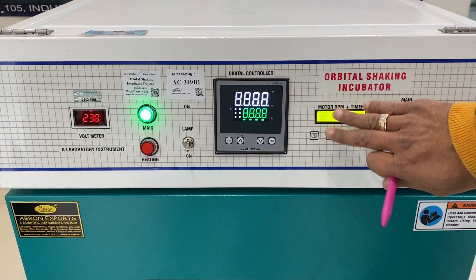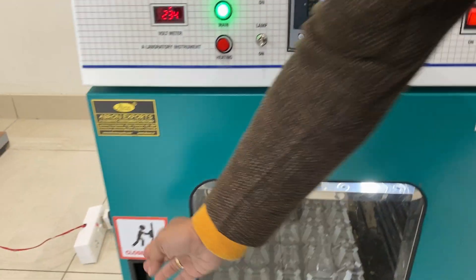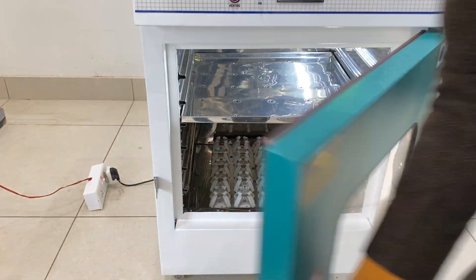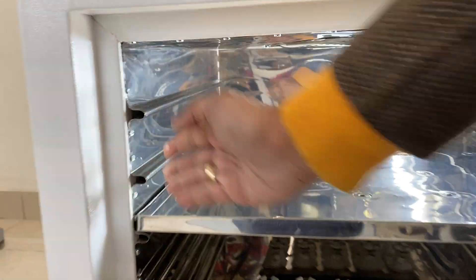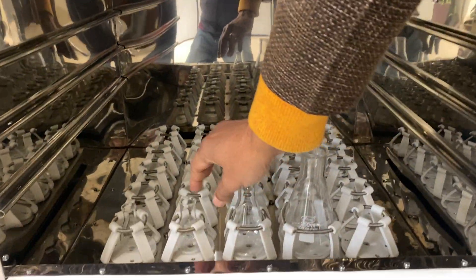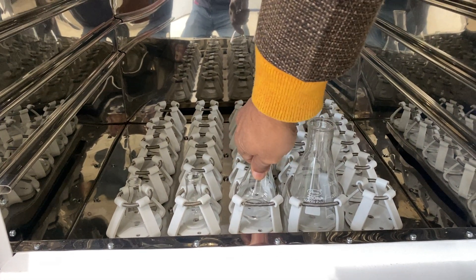When you switch it on, it automatically has a memory inside. Now I'll tell you: this is the lock — open it. This one is the tray, and these are the heating sections. You can take out the flask from here very easily.